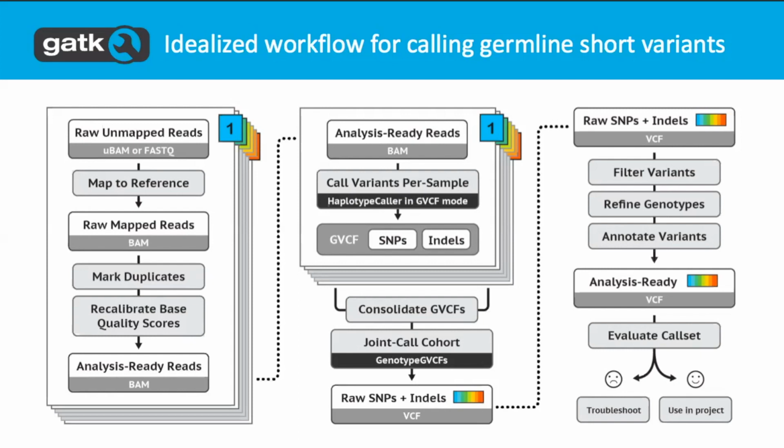Where it gets complicated is at extremely high amounts of data and very low amounts of data. Let me start with the higher end. When you have extremely large numbers of samples, like we're starting to get into the 100,000 whole genomes, there's a lot that we can parallelize, but when we get to the filtering stage, there are some technical challenges of scaling up.